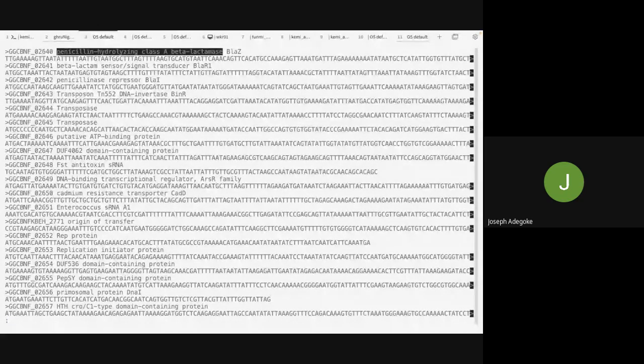To extract this, they have different names. The figure for this will be different from the other sample. So we can't use the O title here just to search for it.